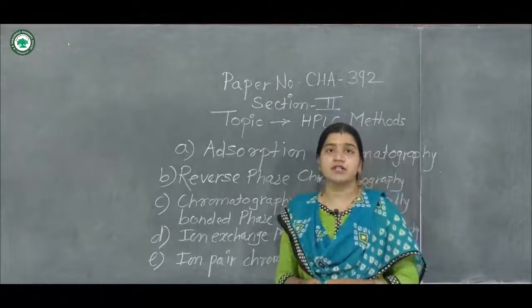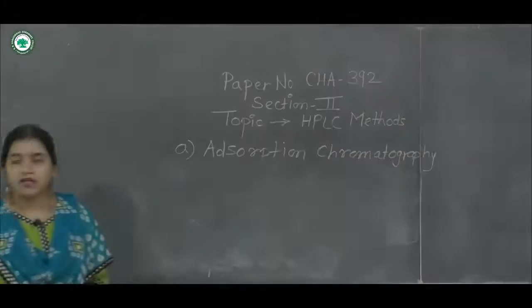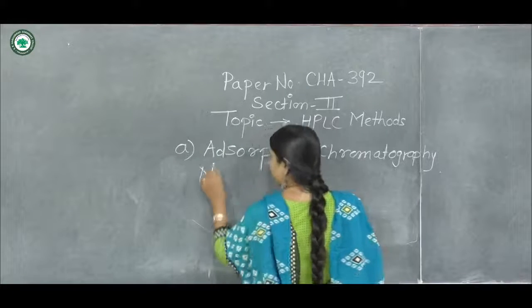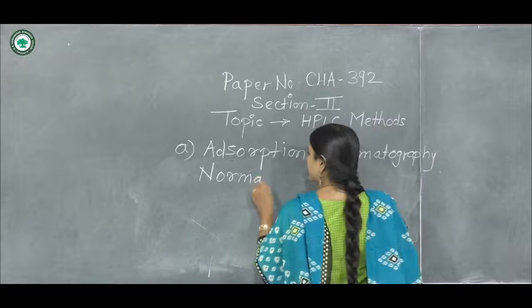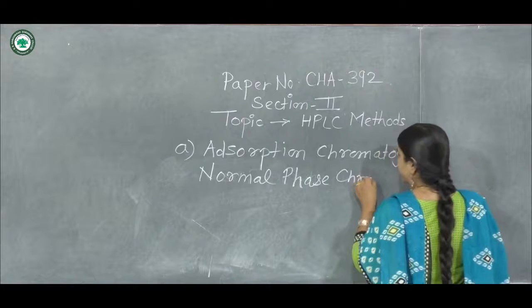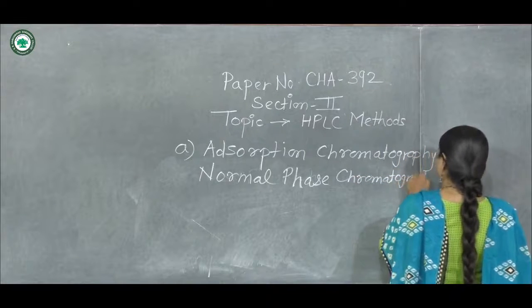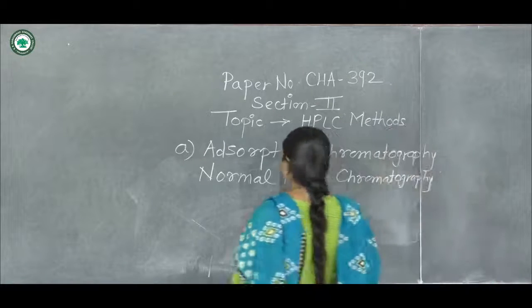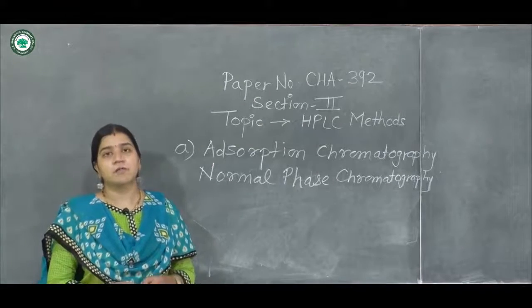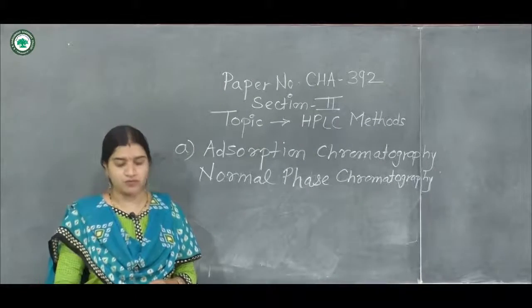So we will discuss what the syllabus is for adsorption chromatography. In this case, we will begin our discussion with what is meant by adsorption. This is the first point.